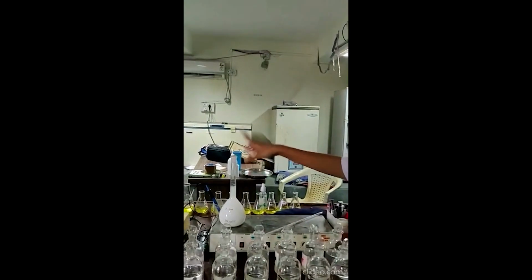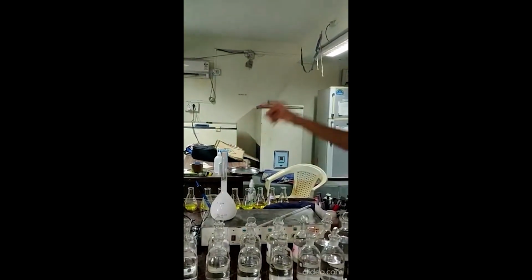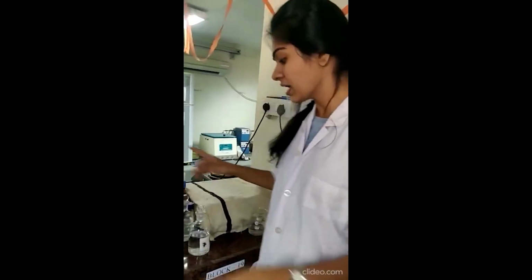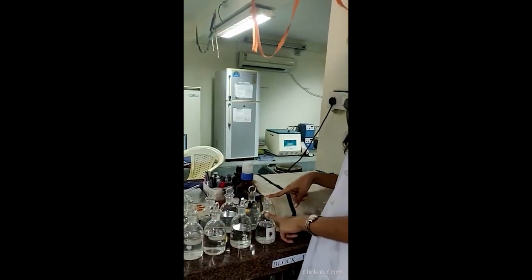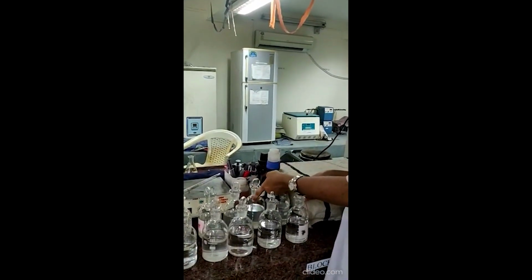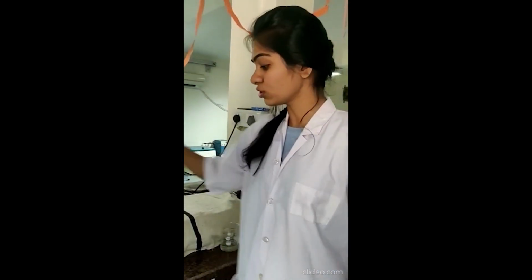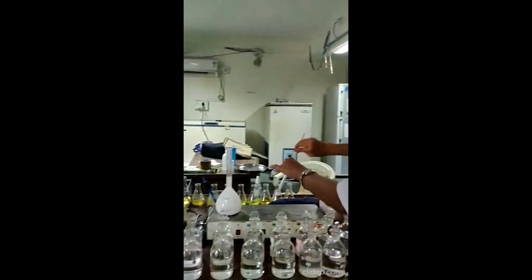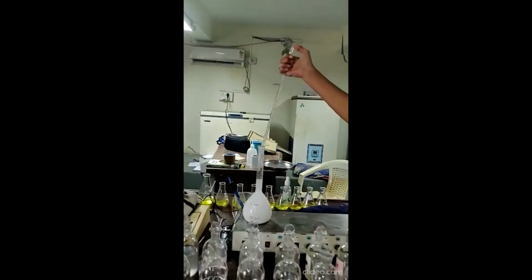The procedure of this experiment involves making the stock solution initially. Stock solution was made by adding 10 gram of bleaching powder in 500 ml water. That's how we made the stock solution. And now different concentrations of stock solution will be added in all of them. We have 10 BOD bottles of tap water and 10 BOD bottles of wastewater. What we'll do is add stock solution of varying concentration in all of them.